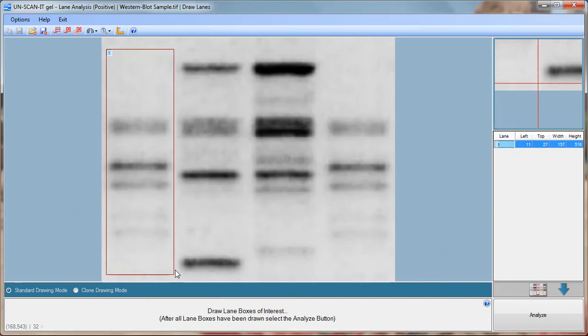You should generally draw the box starting above the top band and extending below the bottom band and wide enough to include all the bands in that lane.